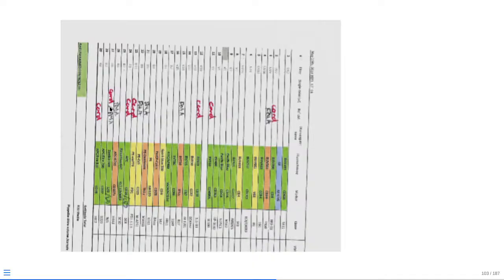So you may be wondering, is this actually going to be significant? Do you actually really need to do that? Can you just get away with subtracting out a regular autofluorescence background across everybody? Well, you could try it and you could see. But it's often in conflict with that second rule for the good unmixing controls. You want to try as much as possible to make sure those backgrounds are matched. So in this case, for this walkthrough, we're going to do it. We're going to persevere just because it's going to teach us some additional skills, and we're going to make sure the negative column is correctly set for all the fluorophores so that they're matching the correct negative background that needs to be subtracted.